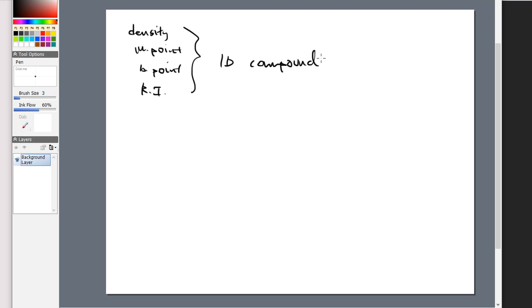We also did a little bit of getting acquainted with things like balances, which are pretty important. And we've done things like working with volumetric pipettes and micropipetters. The reason is that sometimes those are used to report one of these physical property reports that you see on your screen.